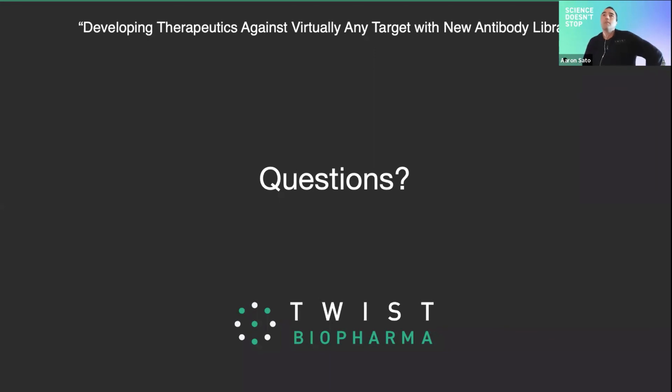Great, thanks, Stephen. Let's see. Another question is, have you taken any clones and purified at large scale? What will be the expression system? So we don't typically do large scale. Our deliverable is a lot of antibodies with characterization. But I don't know, Aaron, do you have any examples of large scale antibody production? What we find is as we scale up, expression just gets better. So typically we'll see maybe 20-30% greater expression levels as we scale up, and we typically scale up in HEK-293, but we have done CHO from time to time.